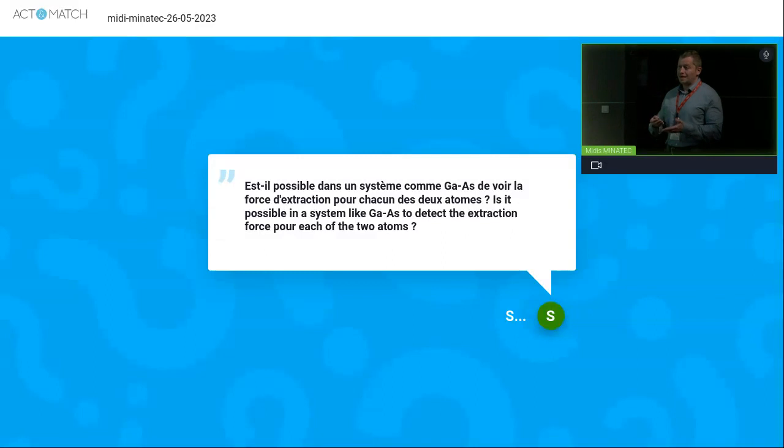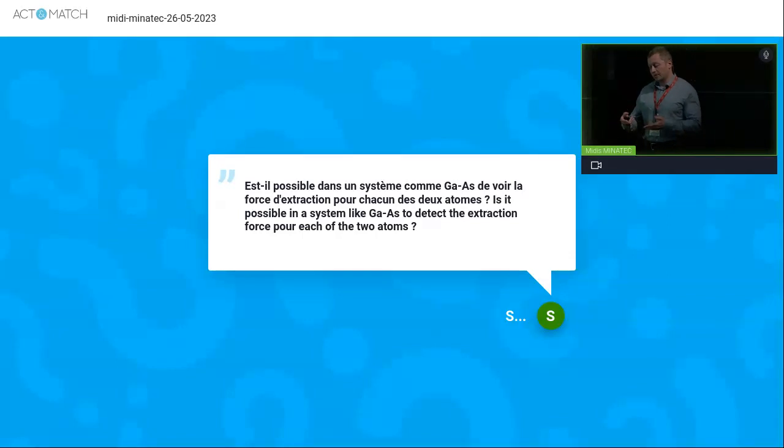So you measure the relative value of the resistance, and this is not an absolute value, because I think you are asking about absolute value. Here the aim is to do the images, so you have the resolution, and you compare the fragment of your sample with another. You have relative change in resistance, but we will not search here for the absolute value of resistance.